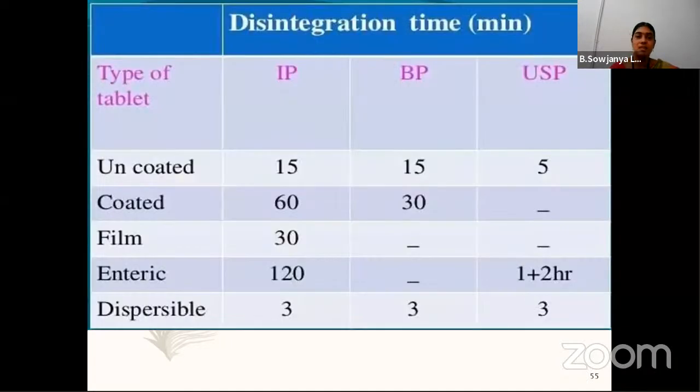And this is the comparison of disintegration times according to the compendia like IP, BP, and USP. For the uncoated type of tablet, it is 15 minutes in IP and BP, and in case of USP, it takes only 5 minutes.